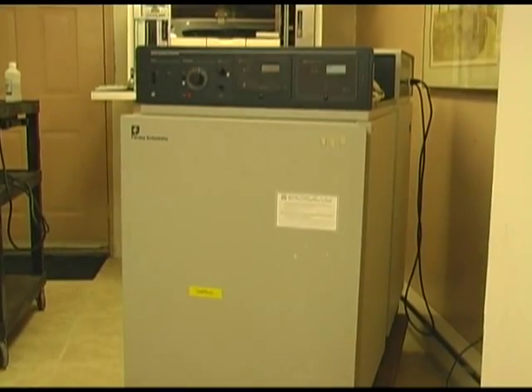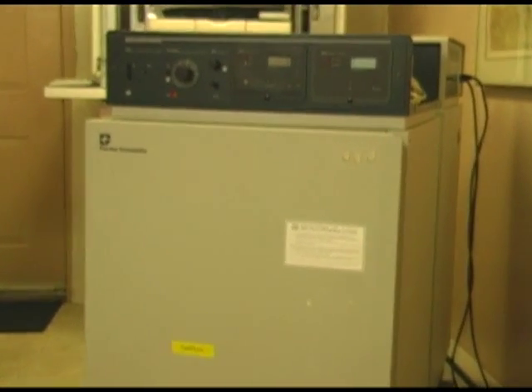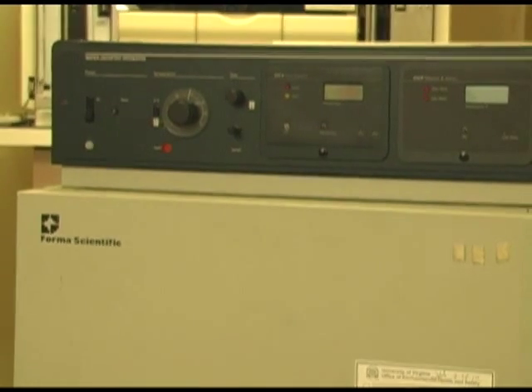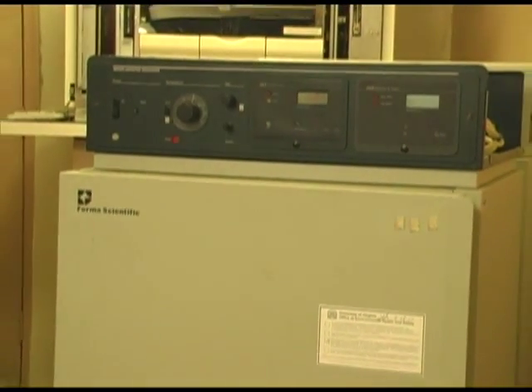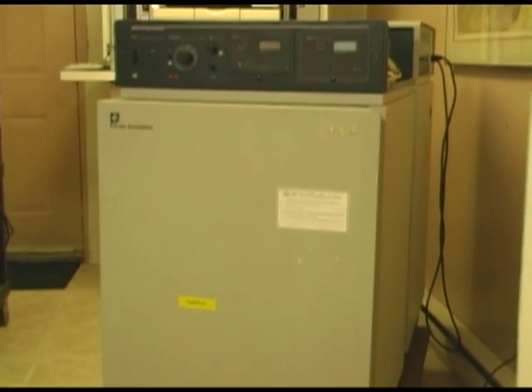Welcome to Biomed Buddy. Today we're going to give you an overview of incubators in general. We are going to be using the Forma Scientific Incubator, model number 3158. It's a fairly old incubator, but an extremely easy incubator to troubleshoot and repair.